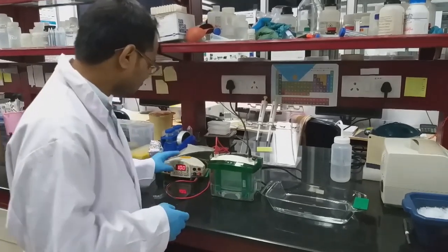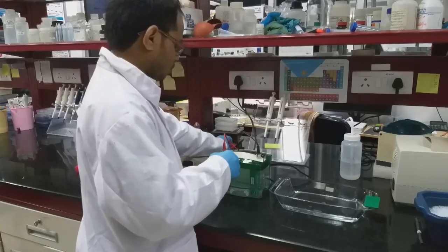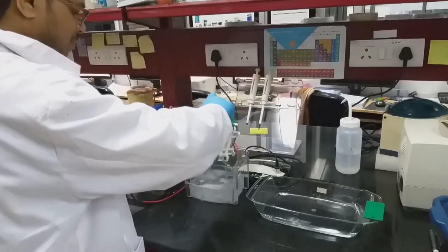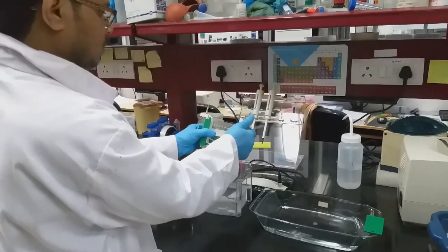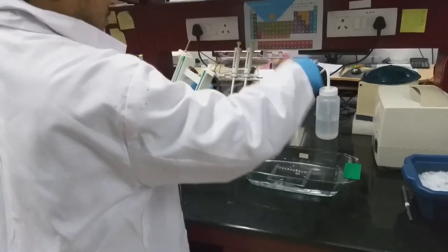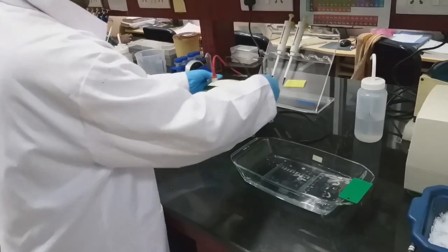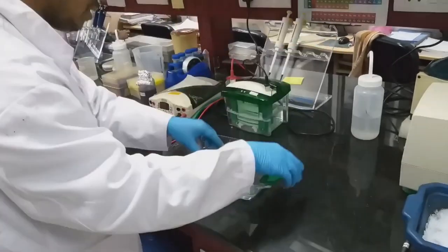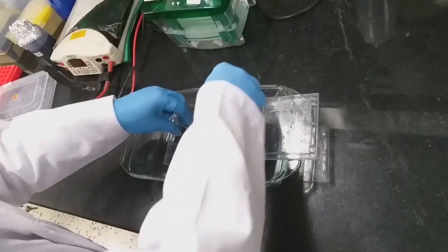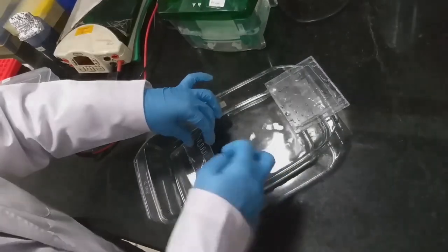So I am going to stop the gel run, then I will remove it. I'll show you how to remove the gel. Take up the glass plates. Here we have to be very careful while taking out the gel, otherwise the glass plates may break. On a corner we have to take and lift the gel like this.